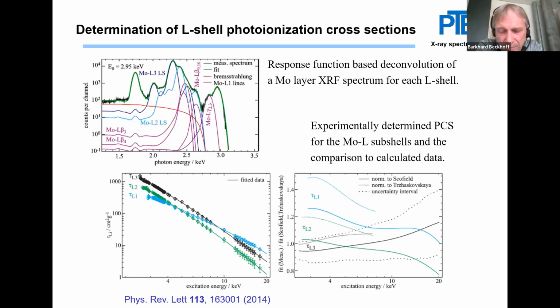So we use from the calibration of the detector the information on the spectral response of an energy dispersive detector, and then convolute the spectral response with all the emission lines of the element of interest, include the self-absorption correction, preferably obtained experimentally from thin layer transmittance measurements, and use deconvolution based on each absorption shell for a physical model of the deconvolution.